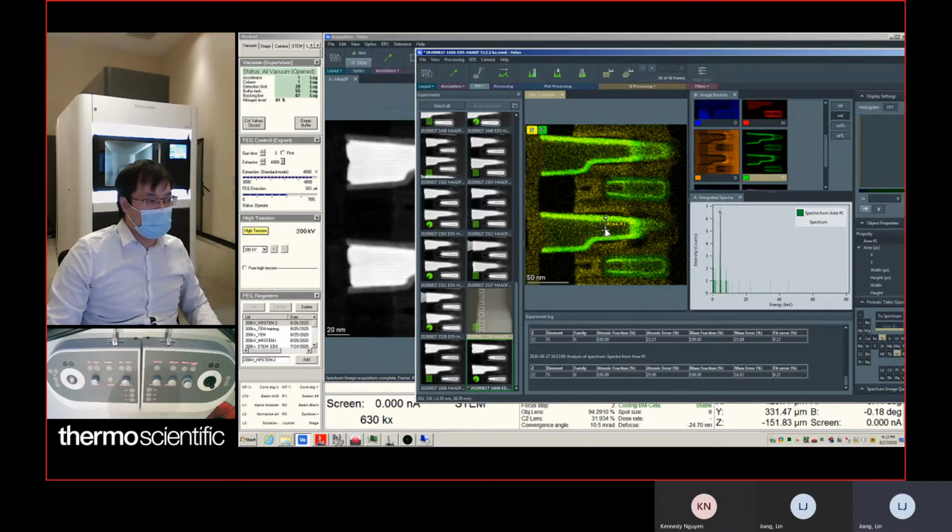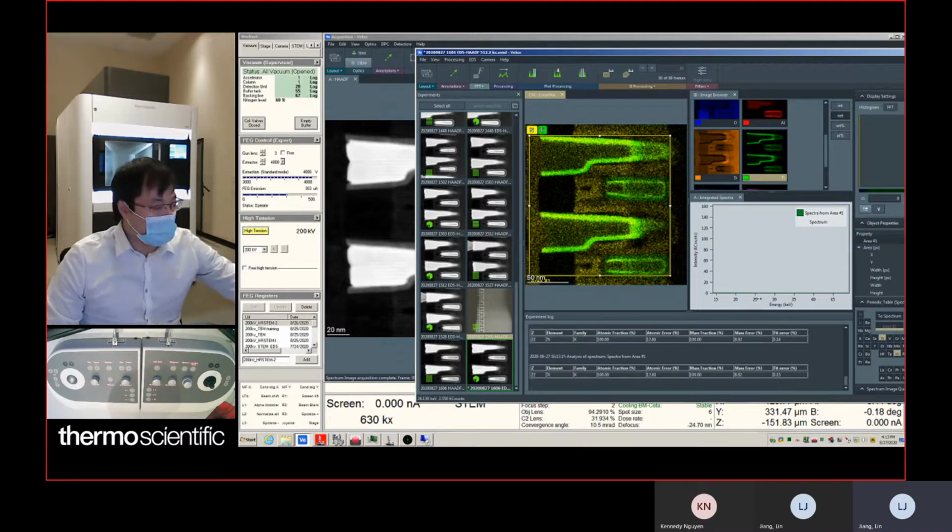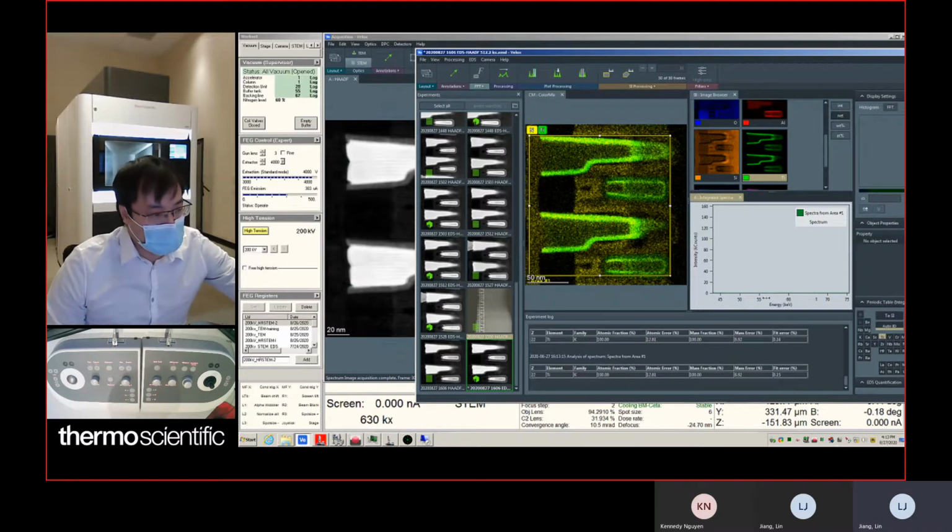It's similar, but for this one, you say you don't have actual peaks from 40 to 80, right? So there's no need to use that high energy range.